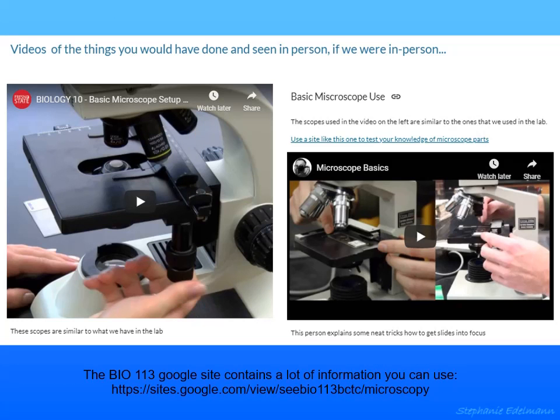A lot of the information that you're going to be using this week for the microscopy lab is going to be on the Google site and in Blackboard. The information is more or less duplicated in both places, so you can find all of it on either the Google site or the Blackboard site, whichever site you're more comfortable with.